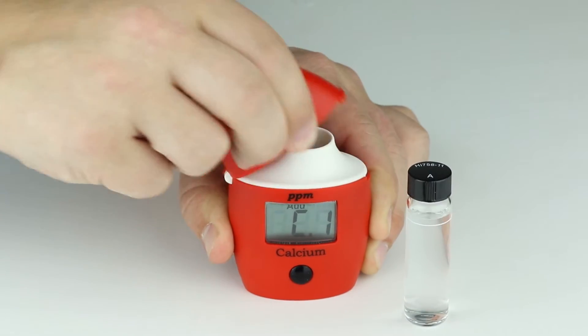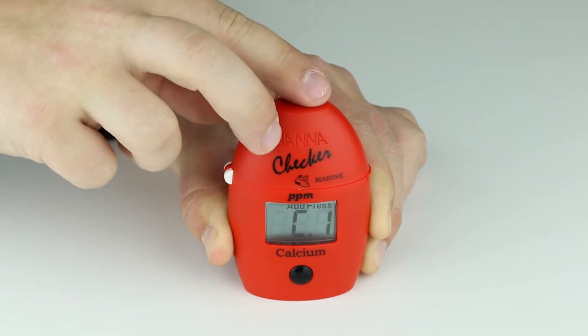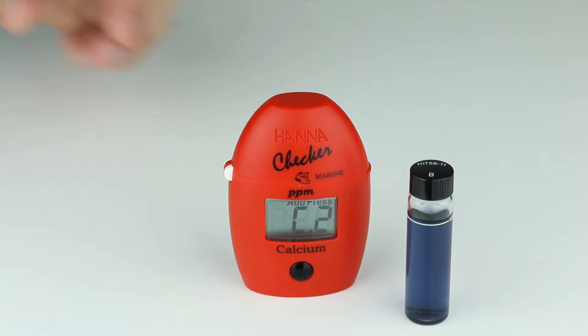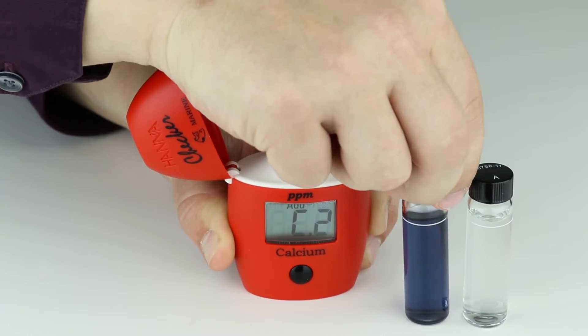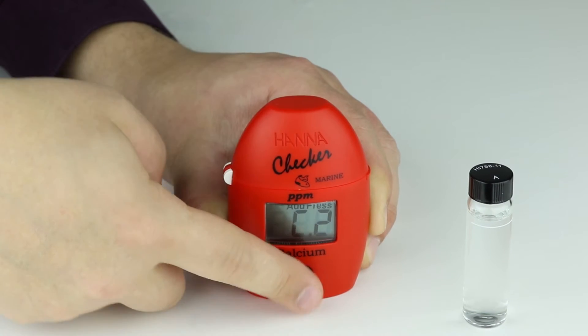To use these standards, simply place the zero cuvette in once ADD-C1 appears and press the button. Then place the second cuvette in once ADD-C2 is displayed. Press the button again to obtain the result.